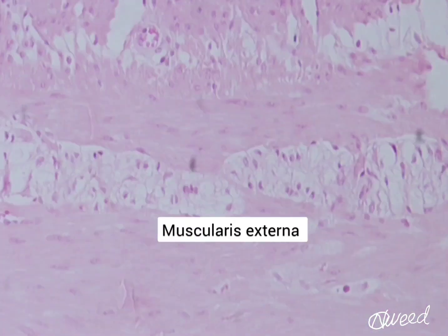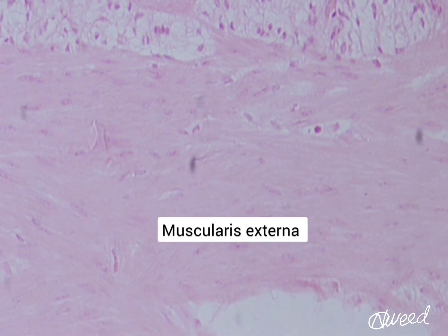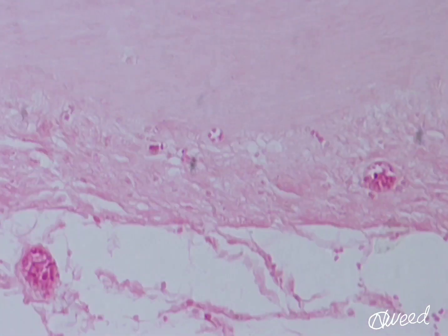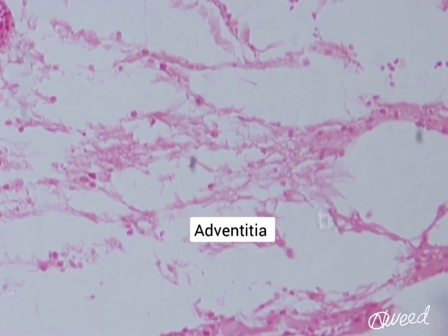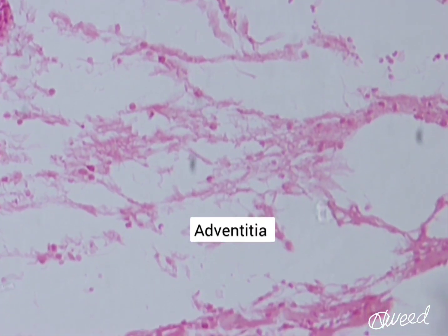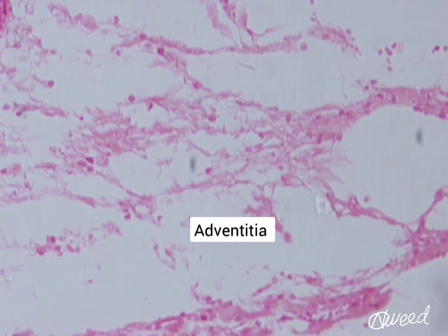The outer longitudinal layer is thickened at three places to form taeniae coli. The transverse and sigmoid colon are completely surrounded by serosa. The anterior surface of the ascending and descending colon is covered by serosa, and their posterior surface is covered by adventitia.